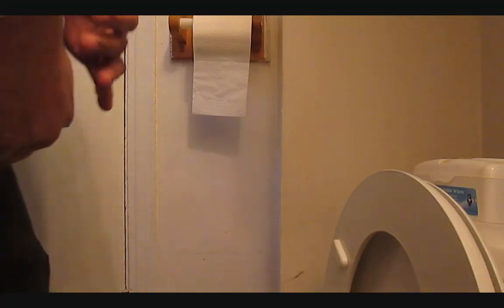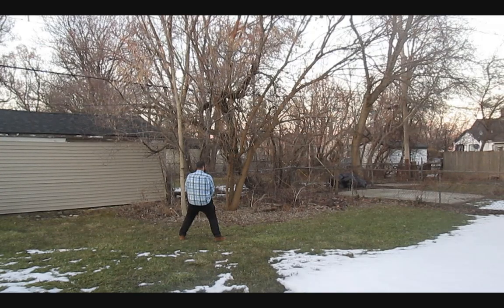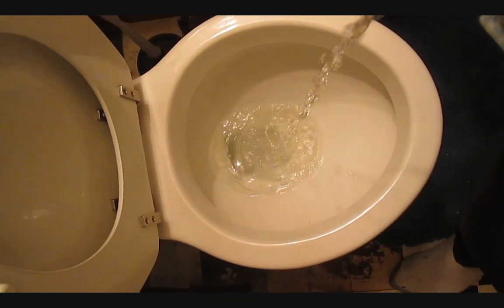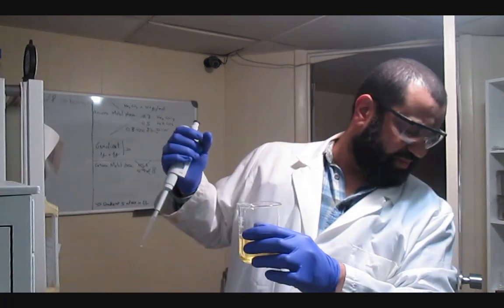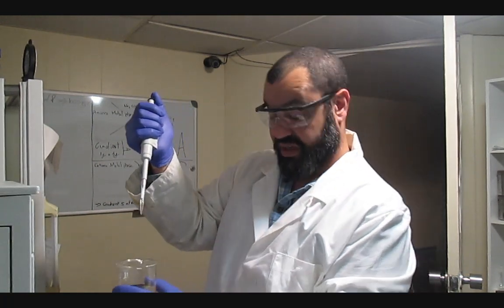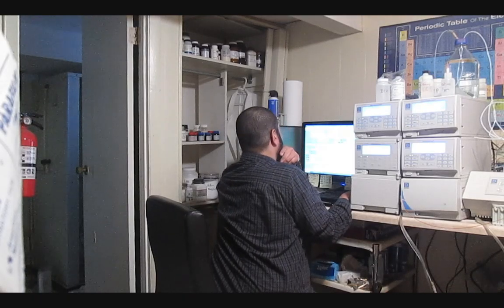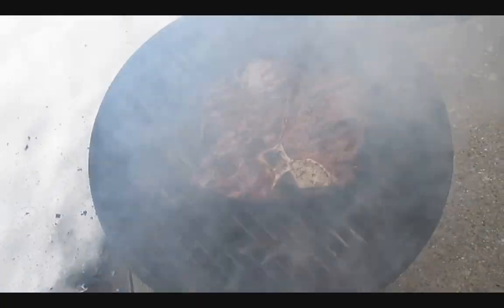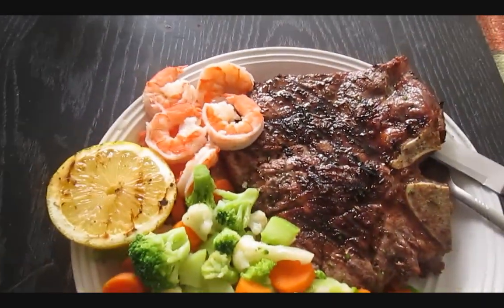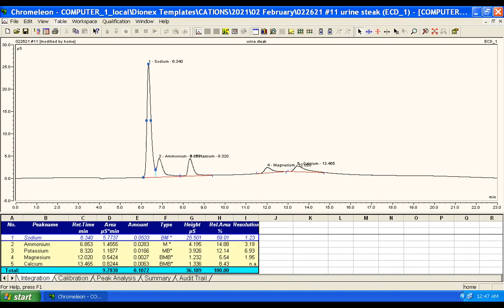Continuing with pleasant smells, I wanted to keep track of my own urine content in various cations and anions, specifically the ammonium ion, since it can be indicative of bladder or kidney dysfunction. Other cation concentrations can also pinpoint a potential mineral deficiency — the logic being that if it's not in the urine it's probably not in the body. Ammonia is produced by the body from the breakdown of proteins to amino acids to urea and finally ammonia. So I tracked my ammonia concentration over a few days, and to be accurate I increased my protein intake with a steak — yes, science can also be delicious.